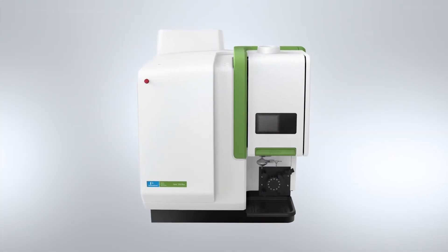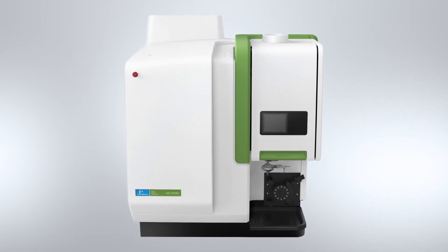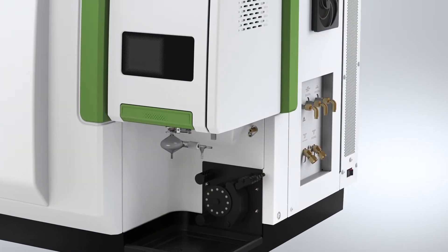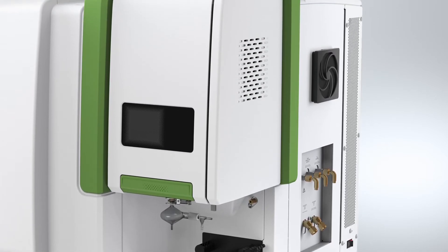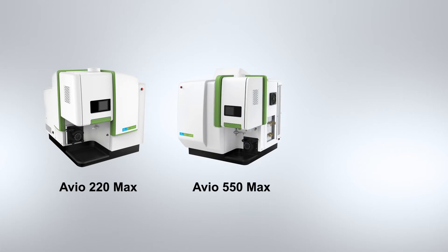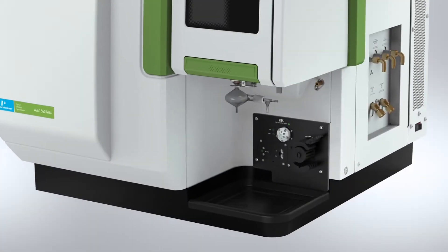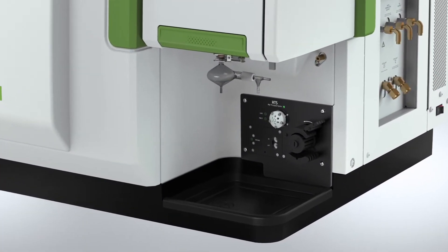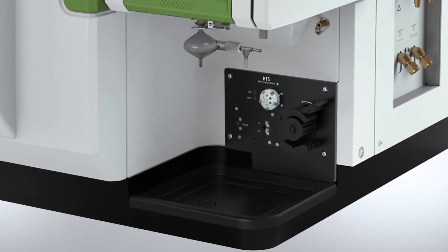The Auvio MAX series instruments are compact, state-of-the-art systems providing superior performance and high reliability with low to zero maintenance features to deliver maximum uptime and exceptional productivity, regardless of your workload. The Auvio series consists of the hybrid simultaneous Auvio 220 MAX, as well as the fully simultaneous Auvio 550 and 560 models. The Auvio 560 MAX delivers exceptionally fast performance with a built-in high-throughput sample introduction module system — our customers are reducing 1.5-minute run times to about 30 seconds.